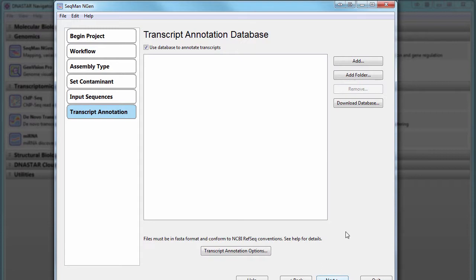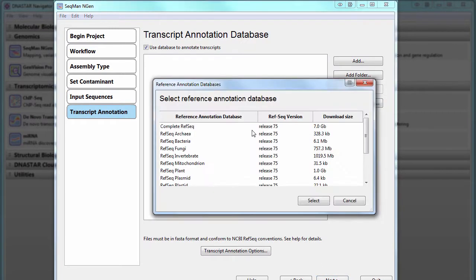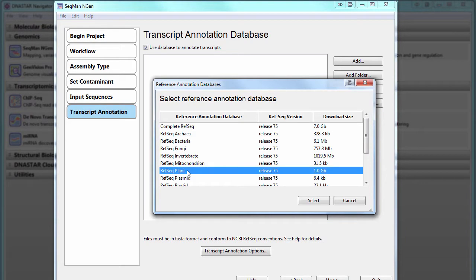Now, download a transcript annotation database from the DNA Star website. In this case, I'll choose Plant because I'm working with Brassica transcriptome sequencing data.